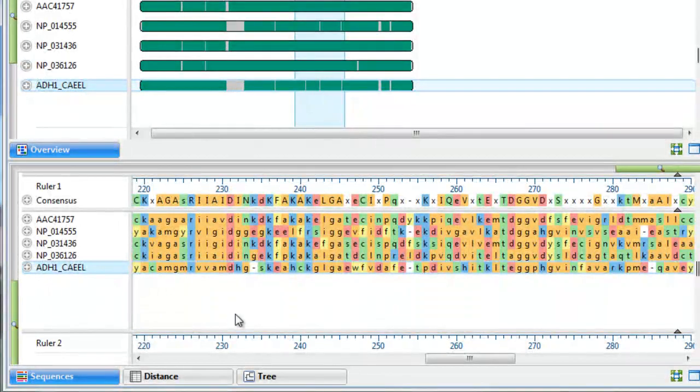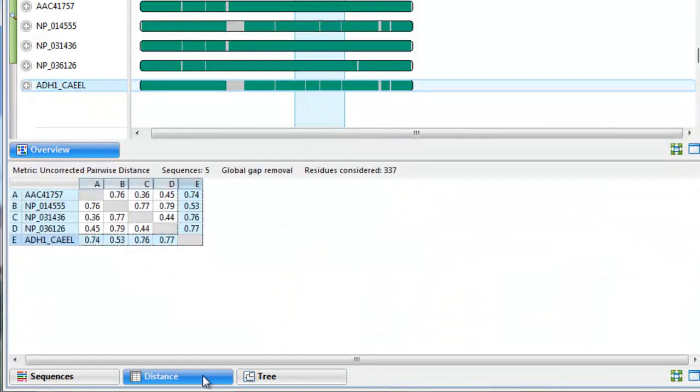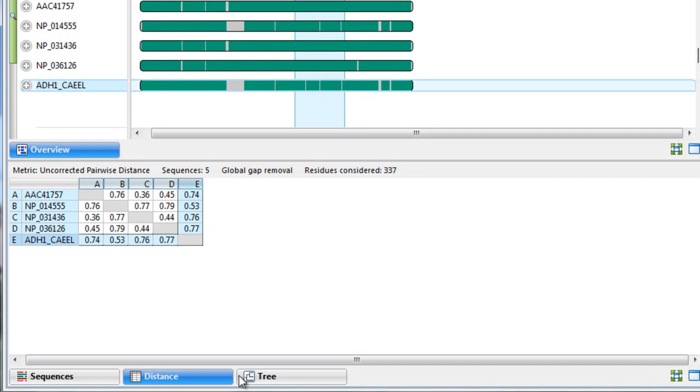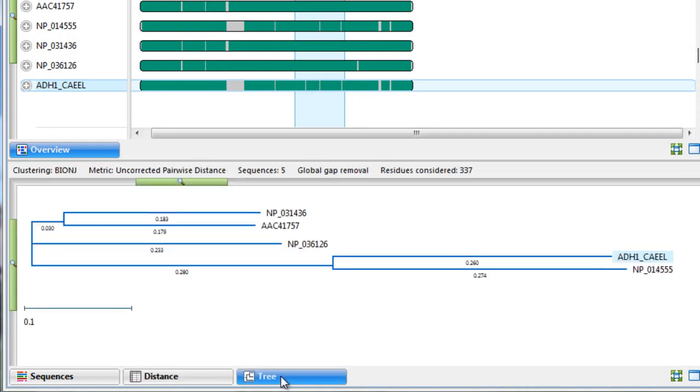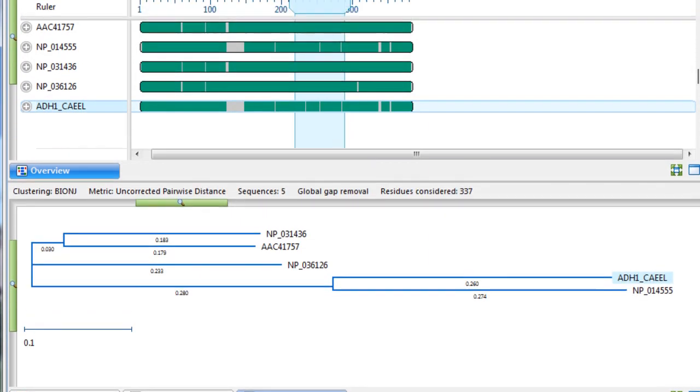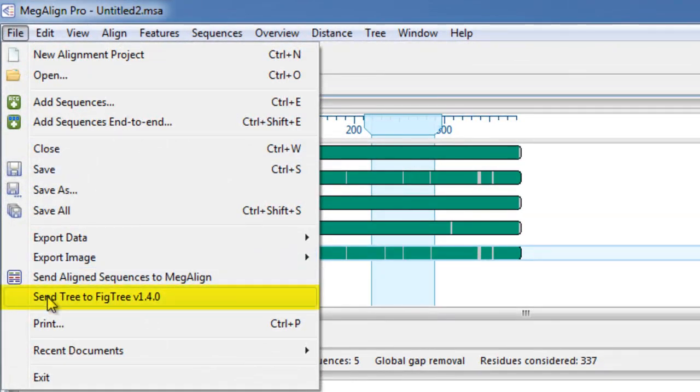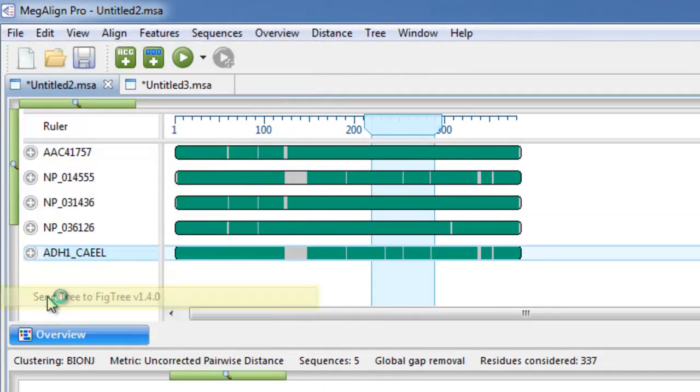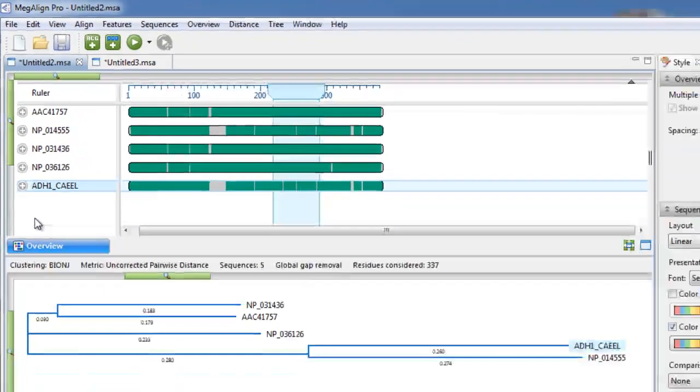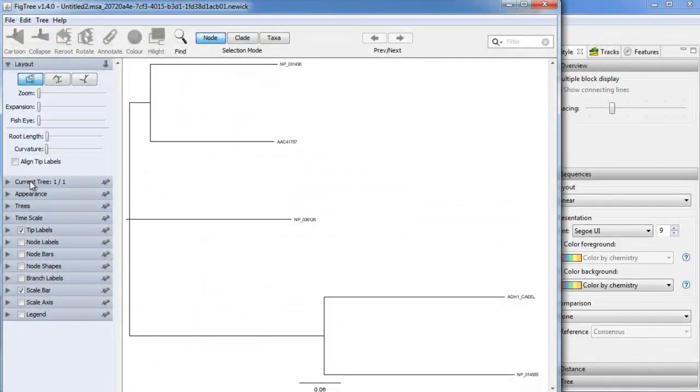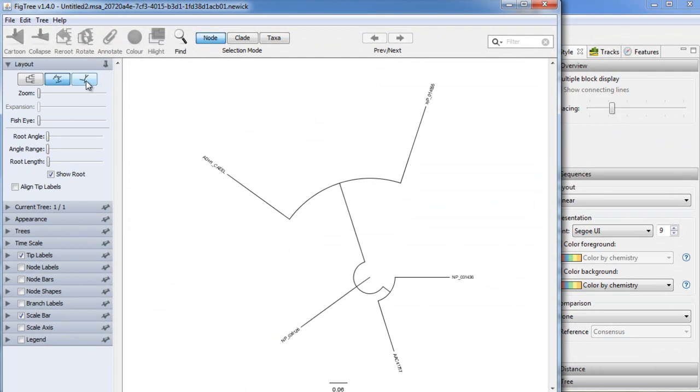Perform phylogenetic analysis using the distance matrix, which details the distances between each pair of sequences, or the tree view. You can also send Megaline Pro trees directly to an external tree viewer, such as FigTree, to perform additional graphical work.